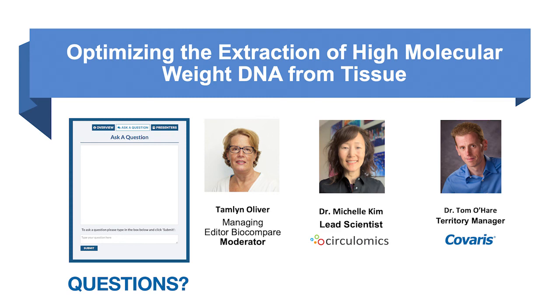So if you want to get it into solution, you're going to have to do that. I know it seems a little scary to people. And people always are very gentle with their DNA when they want it to be very large. But if there's a gel-like texture to it, and it's very viscous, don't be afraid. Just pipette it so you can get an accurate measurement of its concentration.